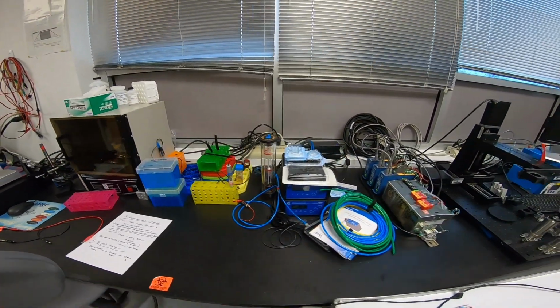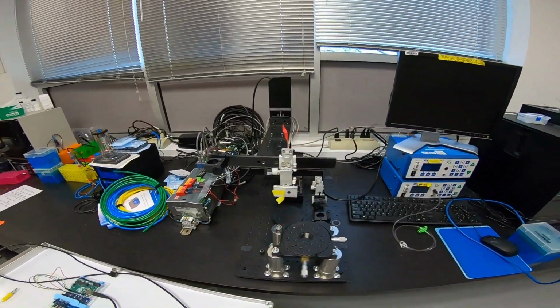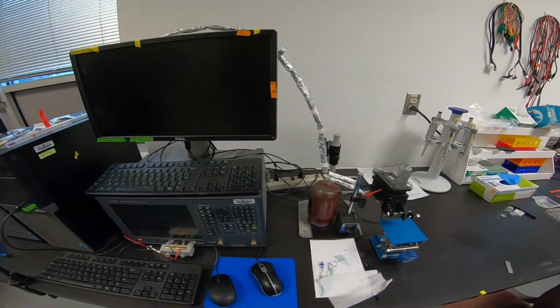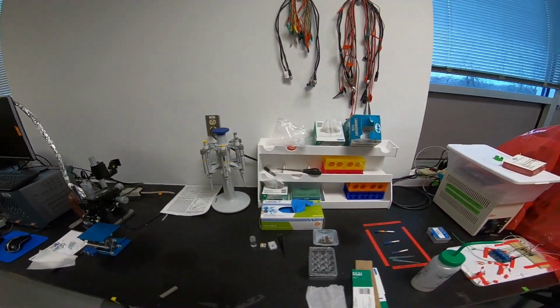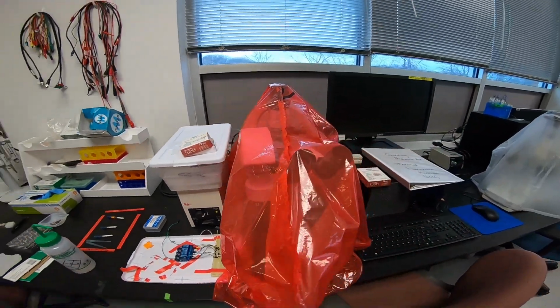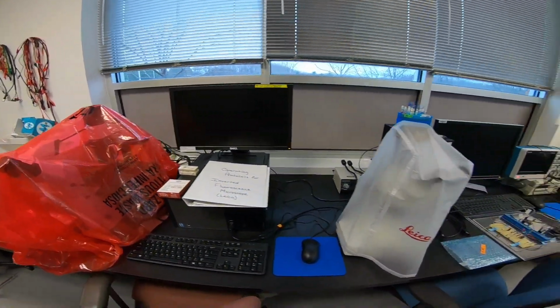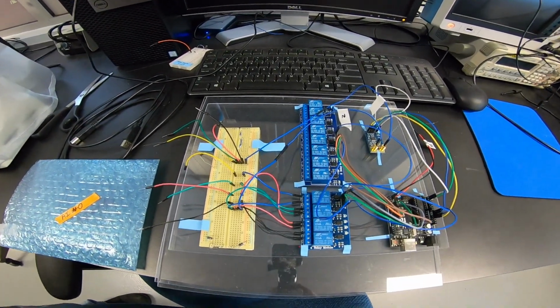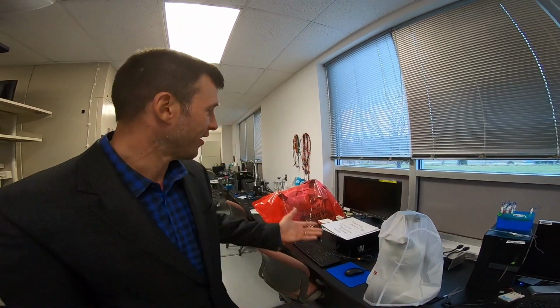Electrochemical sensing, cell culture, additional robots for doing automated characterization and additive manufacturing applications, microscopy for inspecting cell quality, generating image data that can be used for those applications, and circuit design. A lot of the things that we're working on here in the lab are related to miniaturization and process integration, and these analytical capabilities allow us to pioneer those areas and allow students to have access to top-of-the-line instrumentation to support their research in this space.